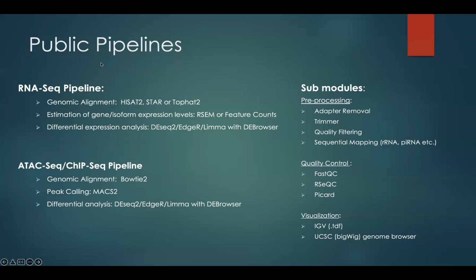And then, using all these results, you can run RSEM or featureCounts. Those are also replaceable. RSEM quantifies the transcripts using a likelihood function. It means that for every read, it is calculating a probability to find the origin of that read on the transcriptome, also by checking the quality information. So it's a more sophisticated algorithm using a likelihood function in the background. But featureCounts is just counting the number of reads coming from that gene. It's not using any sophisticated algorithm.